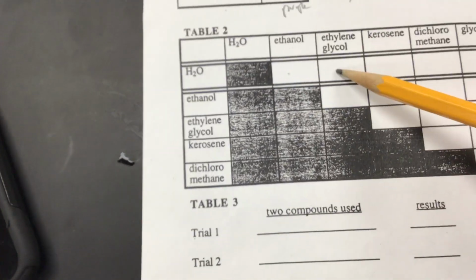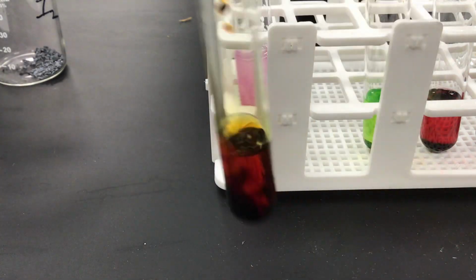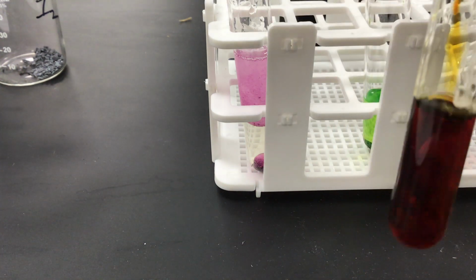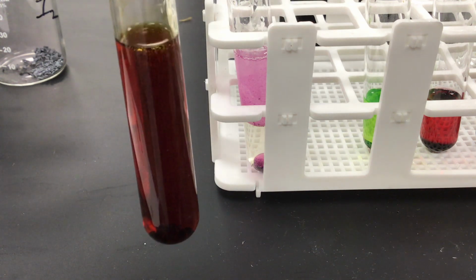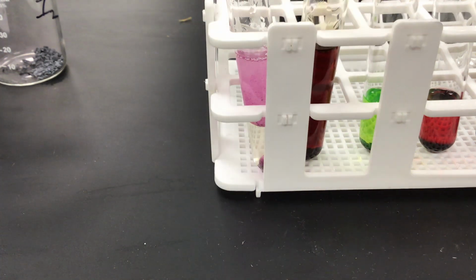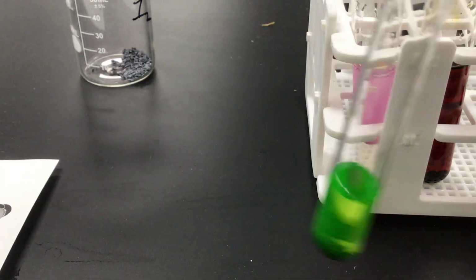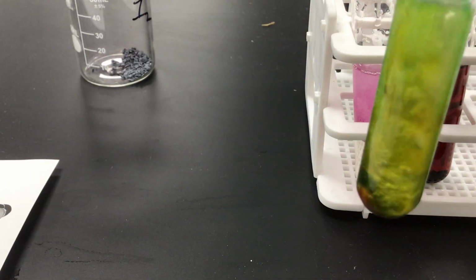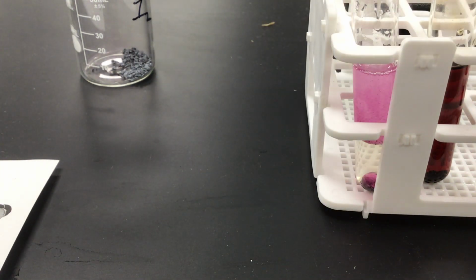So now what we're going to do is add water to each of these and then see what happens. So the first one is water and ethanol. Do we end up with 2 layers? No. So that means the water and the ethanol mixed. How about water and ethylene glycol? Did we get 2 layers? Nope, so they mixed.